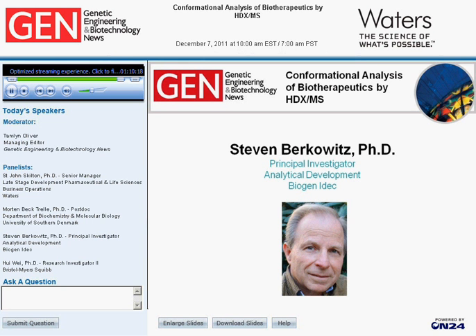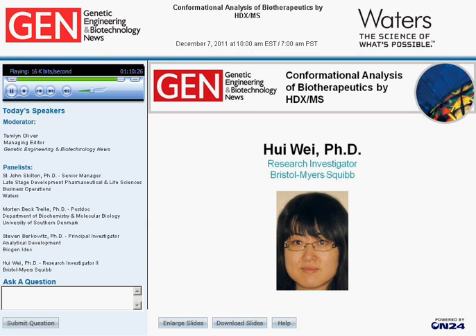Okay. Hoy, do you want to weigh in on that question? Yeah, I completely agree with Steve. So usually you get about a few amino acids of spatial resolution in the peptide level HDX, and with the assist of MS/MS, like electron transfer dissociation, or even with the assist of ion mobility MS, you help to improve that spatial resolution as good as maybe single amino acid. So yes, that's exactly what the local level HDX can do.